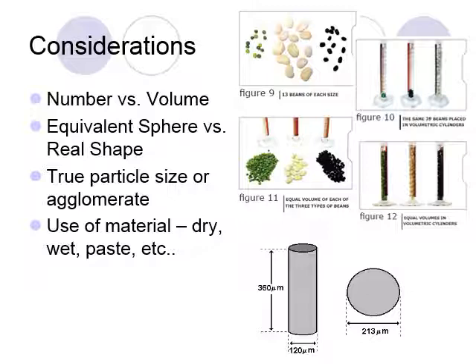But sometimes for processes where you use a material, you do care about agglomerate size. So you have to consider that when you start to do the processes that happen during particle size measurement where particles can be broken apart to be measured. That's usually a good thing. If you want agglomerates, then that might not be the representative measurement you're hoping for.